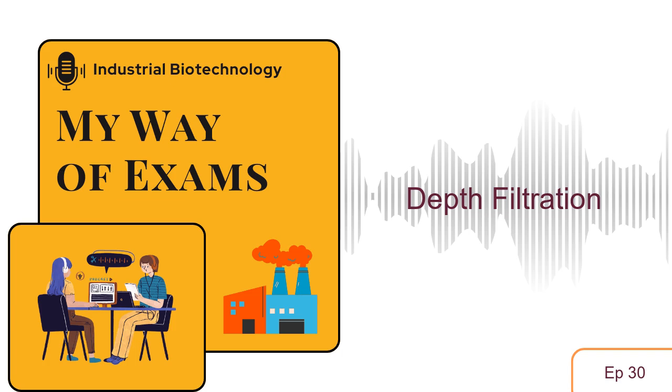So what you're saying is it's like a layered approach. You start with depth filtration to get the big stuff out of the way, and then you use more advanced methods later on to really refine and purify the product. You got it. And that, I think, is a really key takeaway for our listeners. Understanding depth filtration shows you how even in cutting-edge fields like biotech, these industrial processes often rely on smart combinations of different techniques, each one playing a crucial role. It's all about working together.